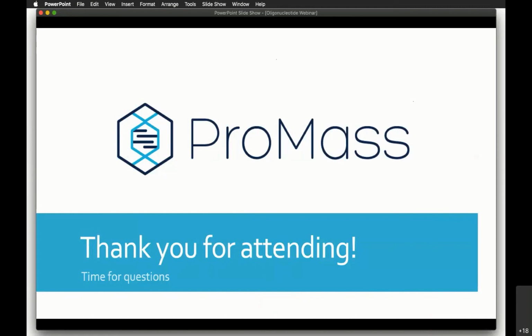Does that make sense? Well, but if I just have some sodium adduct, wouldn't I want to include that percentage? Because I've been putting in internal standards and trying to get a correlation to basically yield off of these little supports that we're using. And I'm wondering, since if I have a large adduct peak, and I'm trying to compare it accurately to this internal standard, whether or not I should include the peak area for that adduct or not.